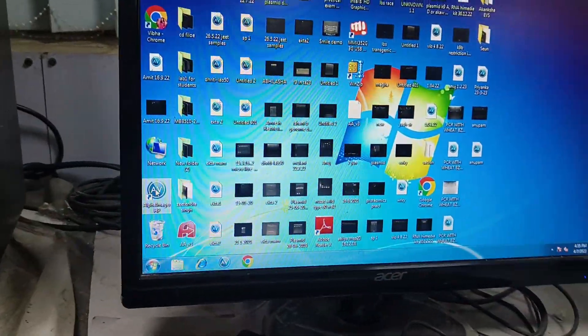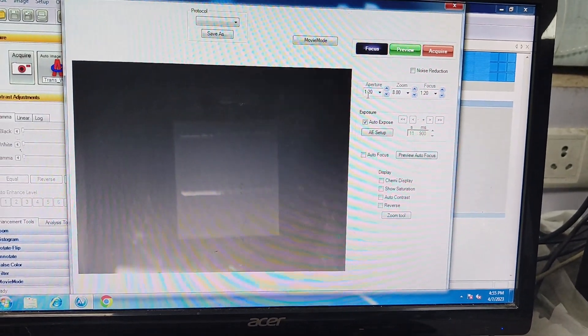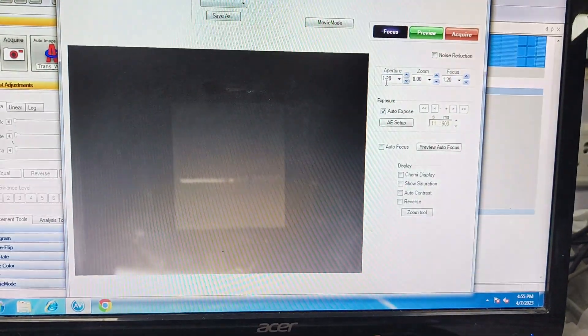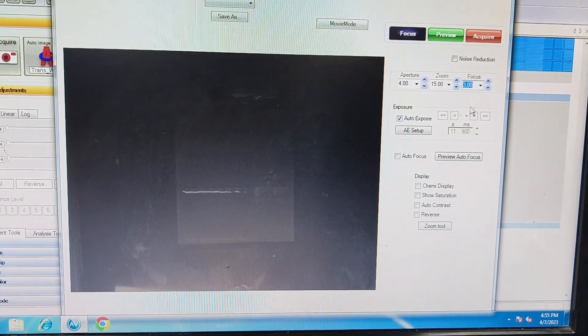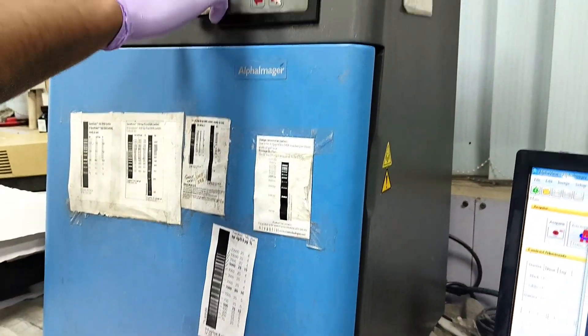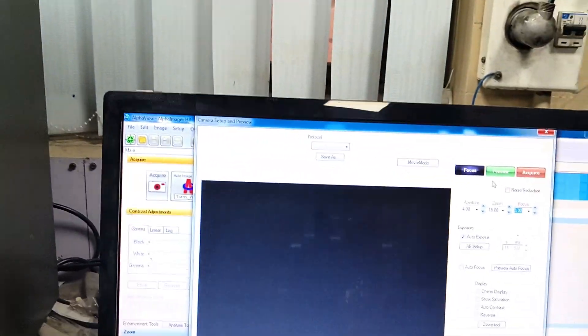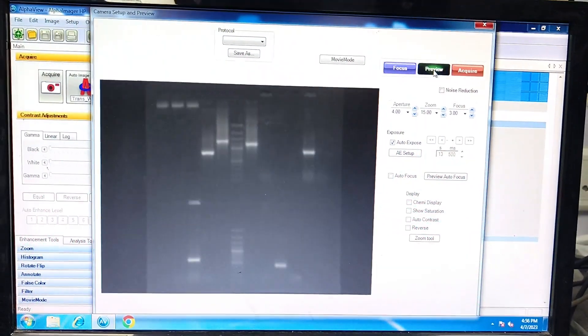Open the software provided with your system. Here we are using AlphaView software. Then adjust any setting as per your requirement. Close the door of the gel dock and switch on the UV light. Here you go. Now we can see a beautiful gel image showing DNA bands of different sizes along with a ladder.